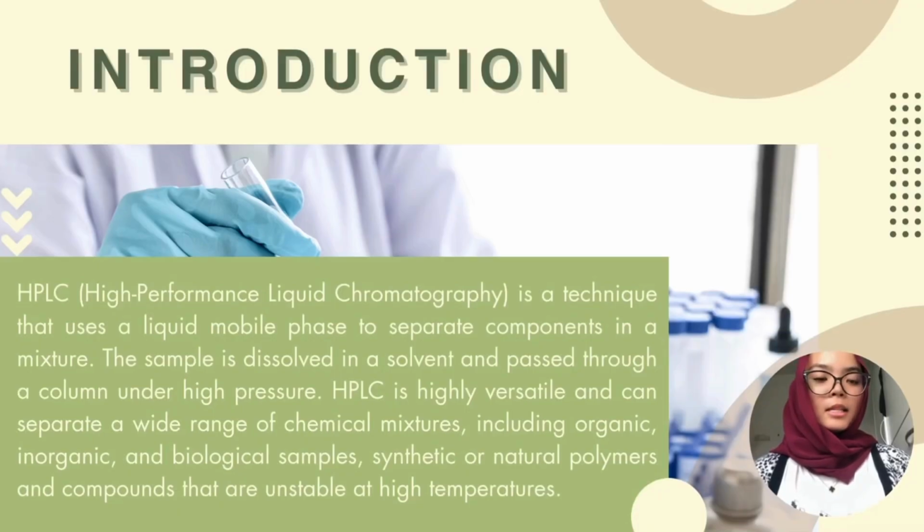I would like to explain the introduction of HPLC. What is HPLC? HPLC stands for High Performance Liquid Chromatography, which is a technique that uses a liquid mobile phase to separate components in a mixture. The sample is dissolved in a solvent and passed through a column under high pressure. HPLC is highly versatile and can separate a wide range of chemical mixtures, including organic, inorganic, and biological samples. Also synthetic or natural polymers and compounds that are unstable at high temperature.